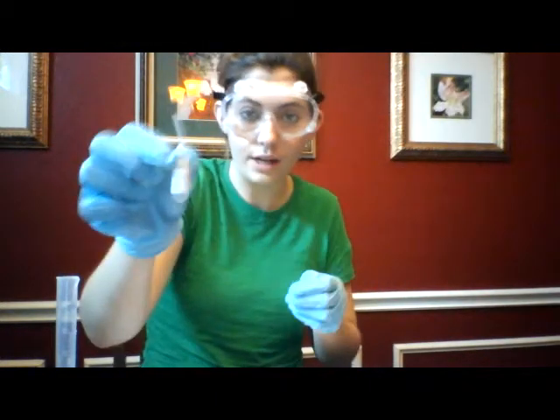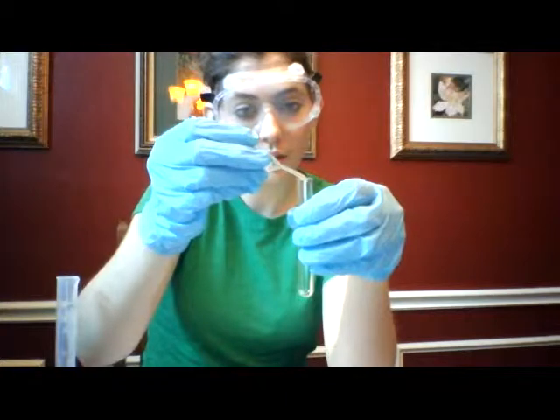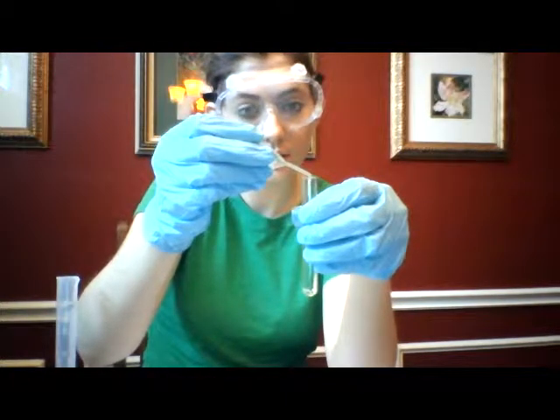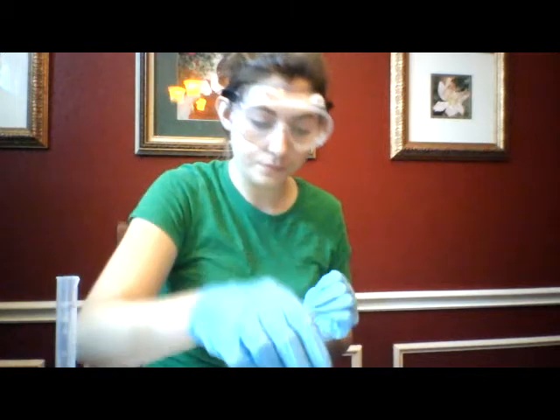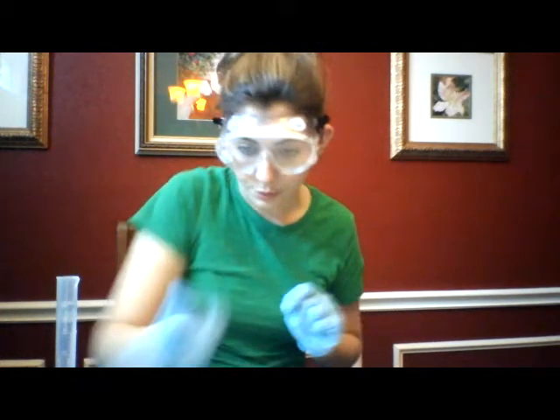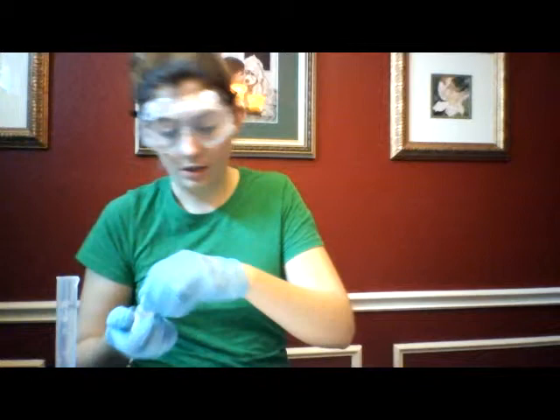So here's our bromide, and do 8 drops. 1, 2, 3, 4, 5, 8. There we go. That's 8 drops. The next thing we're going to add is hydrochloric acid, and we're going to add 8 drops to that.